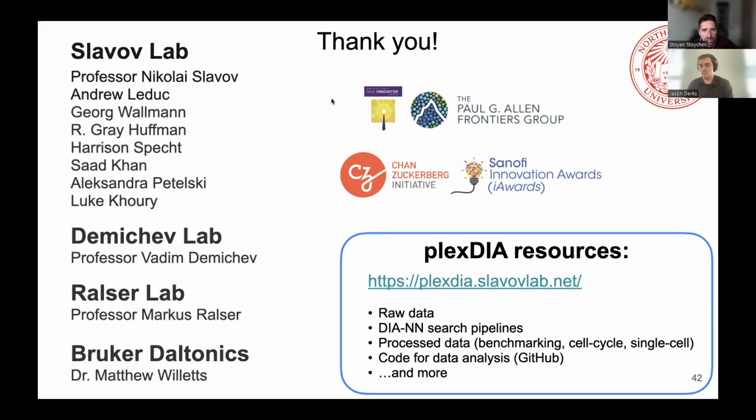We have a question from Jan. First of all, it says great work. Are there any ideas on how to increase the n-plex, and is there a theoretical limit? Do you increase the complexity too much and potentially generate too much interference? Yeah, thank you for that question. There's nothing fundamentally limiting going to higher plex. The reason we use 3-plex is because that is what is commercially available right now.